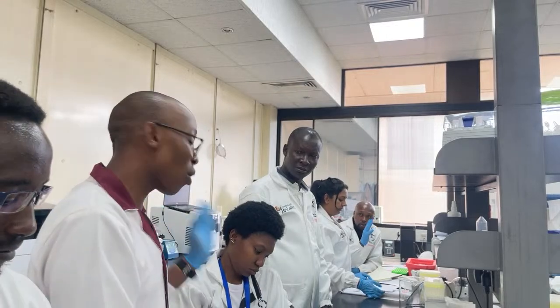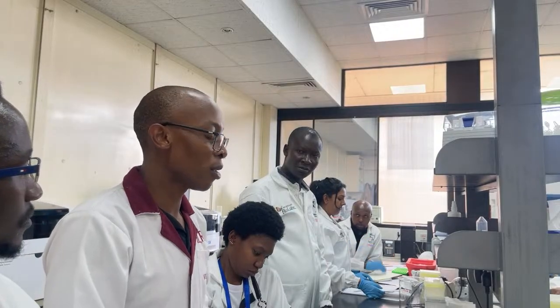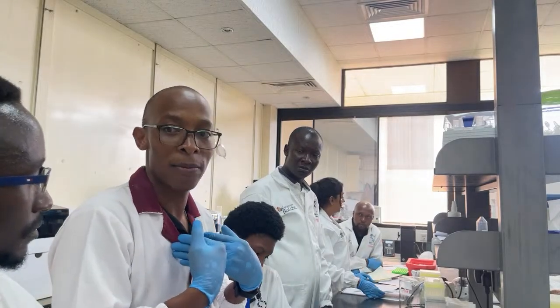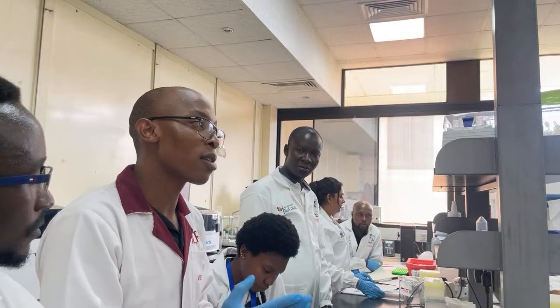So we bought the Fragment Analyzer. Now the difference is just a few hundred base pairs from what we estimated. That's why we are always hitting the maximum output of the SMRT cell.